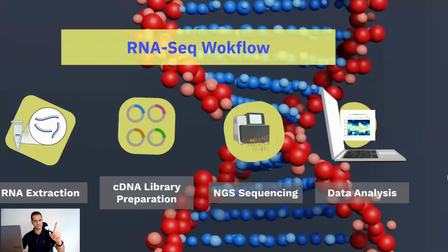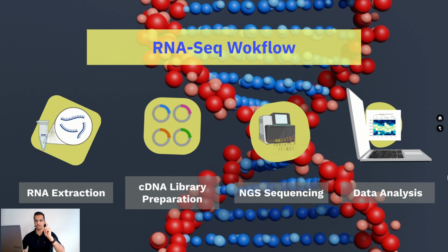RNA-Seq workflow. The first step is RNA extraction and quality control. The second step is cDNA library preparation. The third step is sequencing, for example, using Illumina for short-read sequencing. And the fourth step is data analysis, which includes complex computational steps, and we have to use different platforms, different analyses, different visualization tools, and also machine learning algorithms to do these steps. In the following videos, we want to focus more on this step and learn it together.